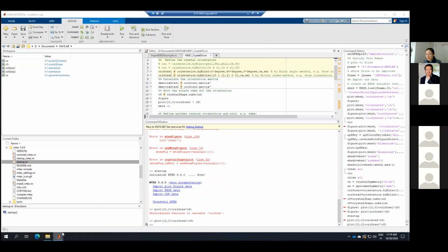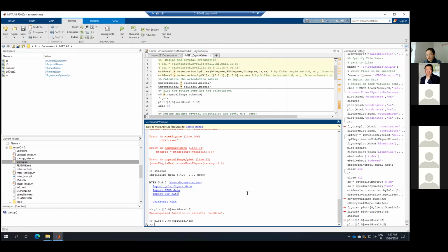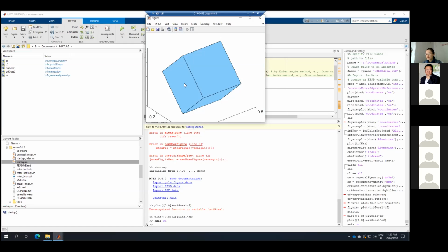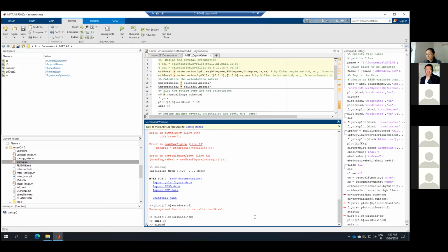So here you can see the first figure for the first Goss orientation definition. And here it's harder to really observe it without any vector definition here. So we just use the axis to outline the sample system. Then you can see it looks like this. And now we can also check for the second definition for this Goss orientation.